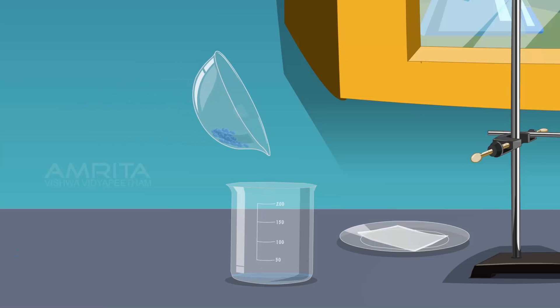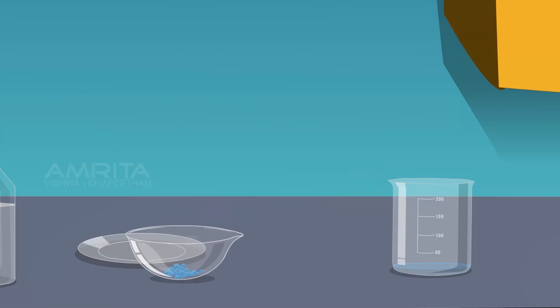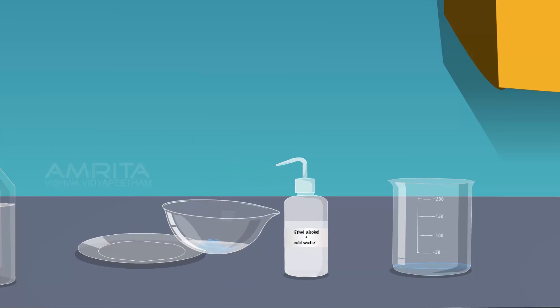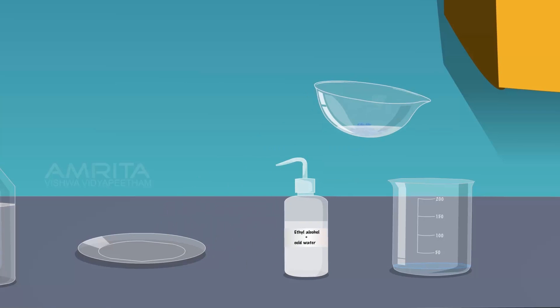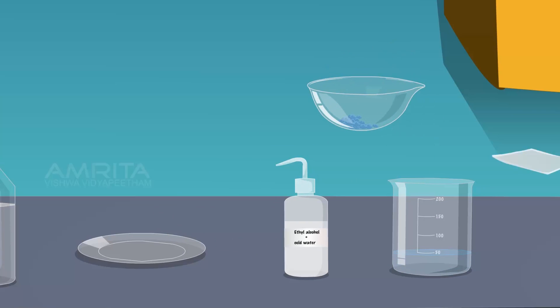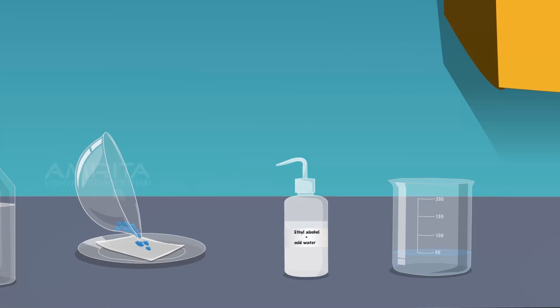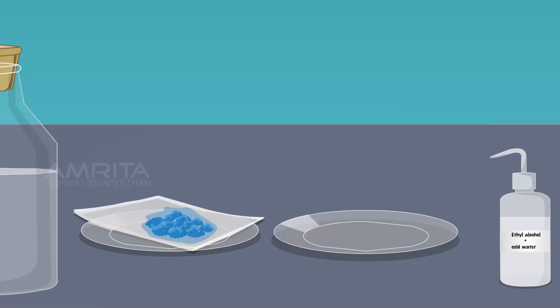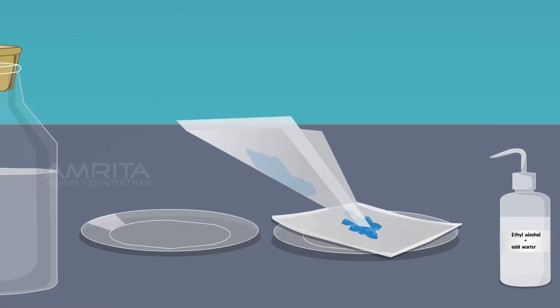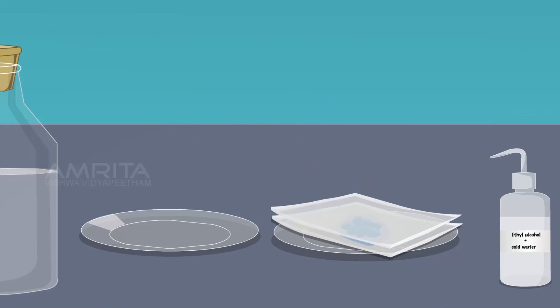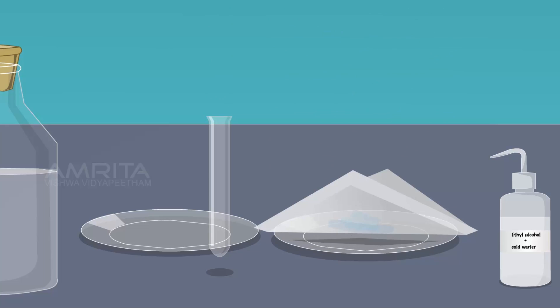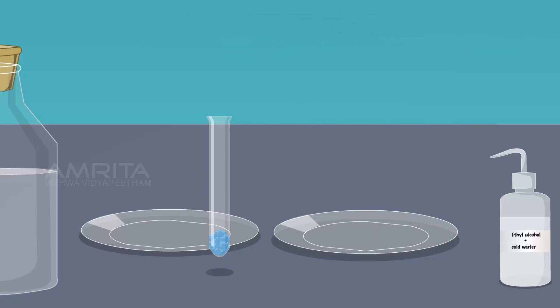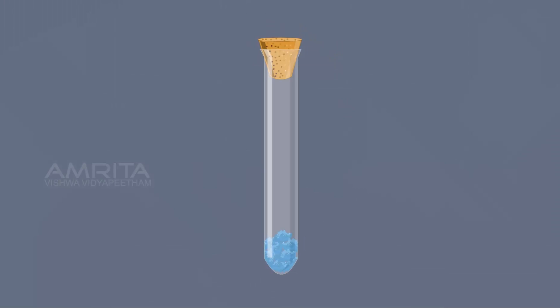Decant off the mother liquor carefully to the beaker. Wash the crystals with little ethyl alcohol containing a small amount of cold water. Remove the crystals on a filter paper which soaks the solution. Transfer the crystals to another filter paper and dry them by pressing gently with another filter paper. Transfer the crystals into a dry test tube and cork it. The crystals of copper sulphate are triclinic, transparent and blue.